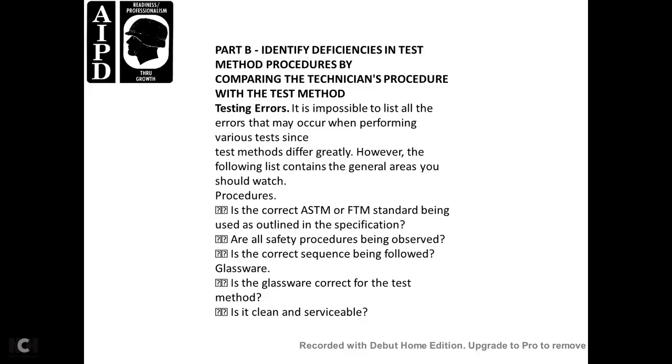Part B, identifying deficiencies in the test method procedure by comparing the technician's procedure with the test method. Testing errors: it is impossible to list all the errors that may occur when performing the various tests, because the test methods differ greatly. However, the following list contains the general errors that should be watched.